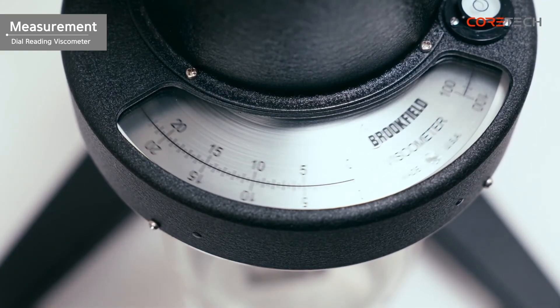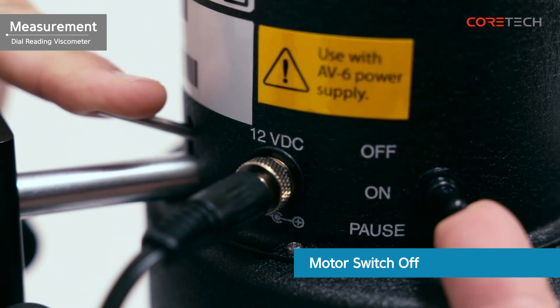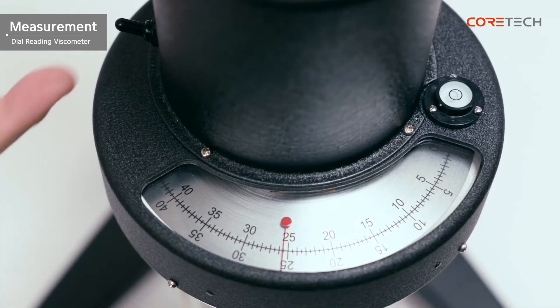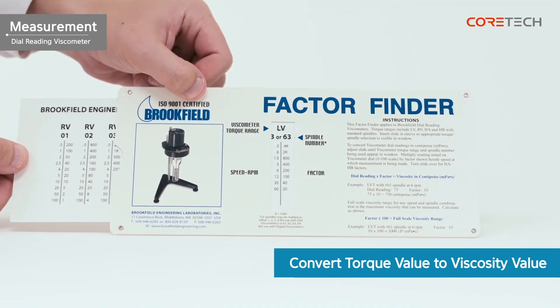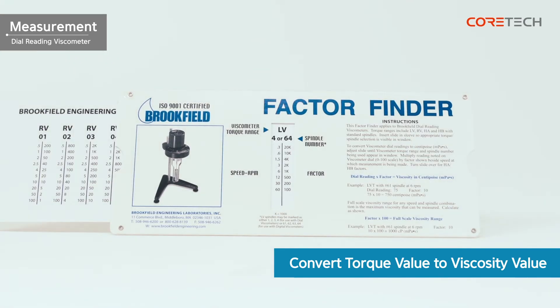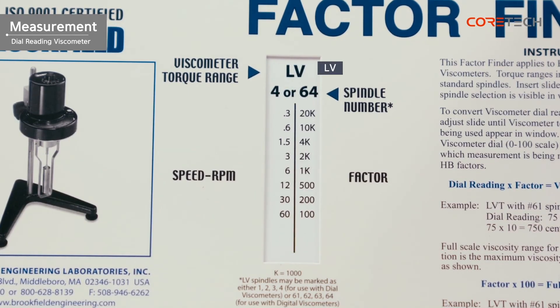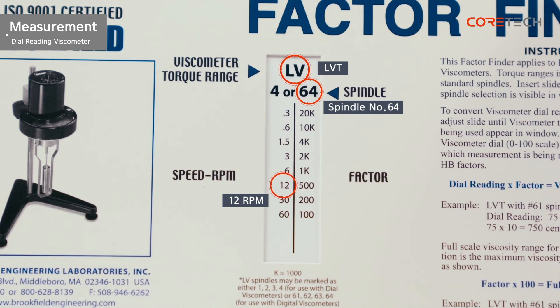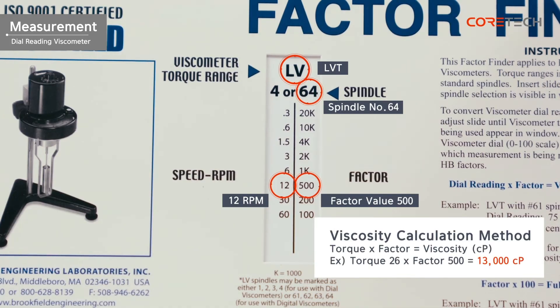Press the clutch lever to hold the scale when the measurement has stabilized. With the clutch lever pressed, position the motor switch to off and read the torque value. Multiply the factor value corresponding to the spindle shown in the factor finder by the torque value and convert it to the viscosity value. For example, if the LVT indicates that the torque value measured at 12 RPM using the fourth spindle is 26, and the corresponding factor value is 500, the viscosity value is 13,000 centipoise.